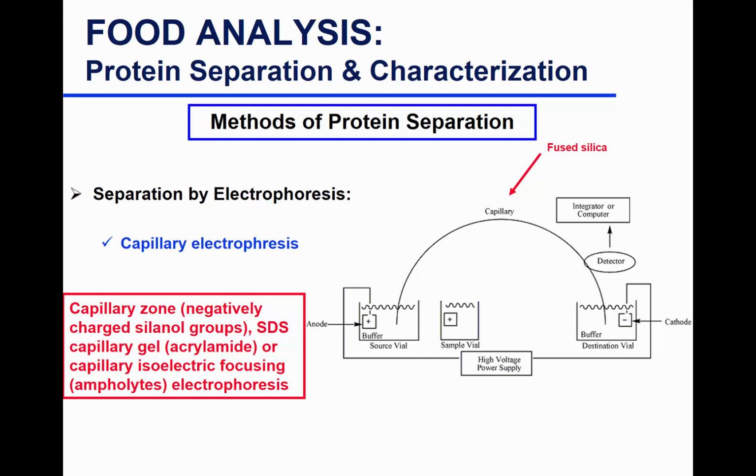You can use electrophoresis for more quantitative analyses, which is capillary electrophoresis. It's a unit that gives you quantitative data. How so? It has a similar principle of separation with electrophoresis, but you can take your samples that get separated and pass them through a detector, similar to an HPLC detector.